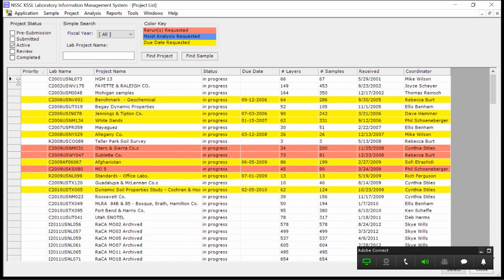For these projects that don't have a priority number, you'll notice that they're mainly older projects. It usually means somebody from the lab brought them back into progress to do some additional testing. There's not a priority number on it because maybe it's an older completed project and we're just doing some additional things. Without a priority number, it just shows up at the bottom of the batch creation list, which is fine because when we're doing this, we usually know to look for those samples on the list.